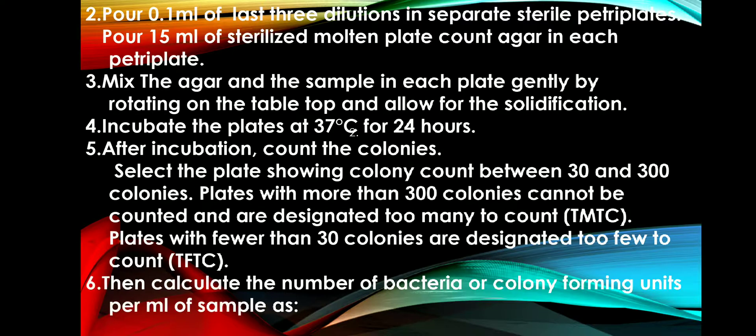Pour 0.1 ml of the last 3 dilutions into separate sterile petri plates. To this, pour 15 ml of sterilized molten plate count agar into each petri plate. Mix the agar and the sample in each plate gently by rotating on the tabletop.